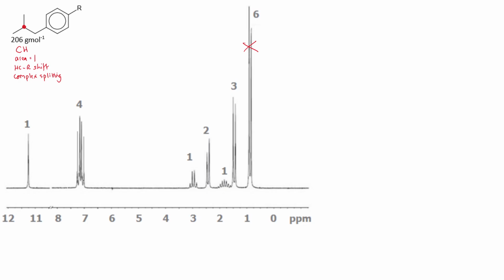So that fits the bill completely, and so once again we can say, right, that one's accounted for. So there we are. Now we've got 2 peaks taken out of the reckoning because they're already accounted for. Now we'll just progress on to the next part of the structure that we know.